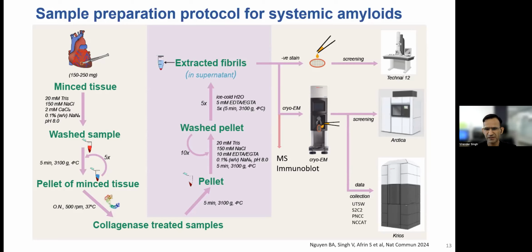We are using a chelating agent to get rid of proteins like SAP, as I mentioned, and those proteins get dissociated when the calcium bound to SAP is removed.